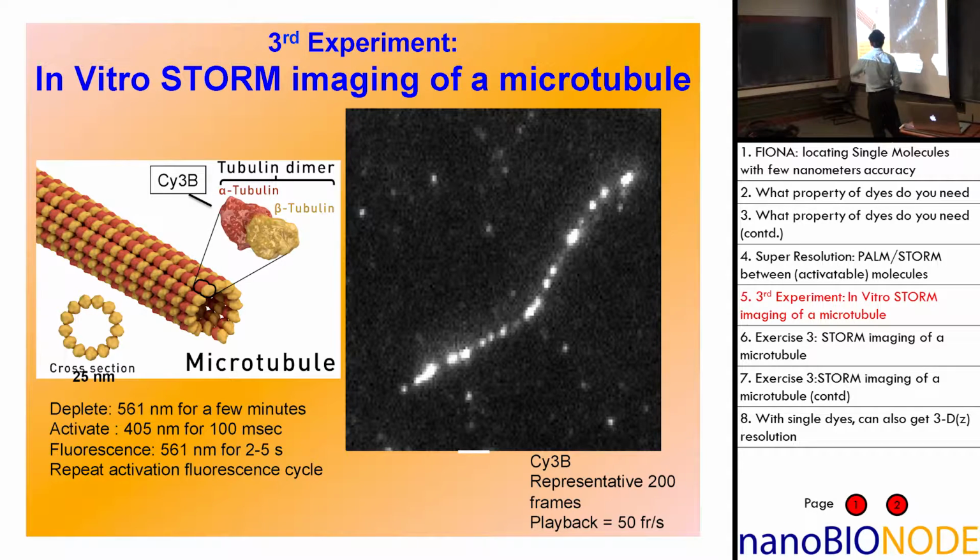In fact, you have a Cy3 here, and a Cy3 here, and a Cy3 there. Many dyes. But with many dyes, you're starting to go into the ensemble regime. It'll be really bright if you shine light at it, and so that's not going to work, right? So how are we going to do this?